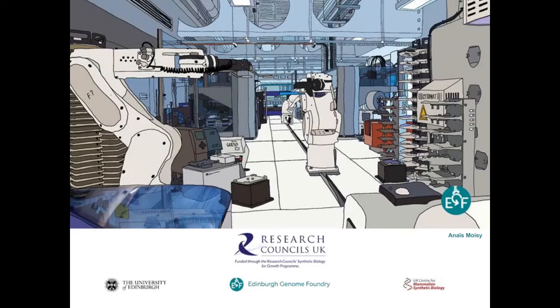What ligase and buffers do you typically work with? Oh, those are fairly bog standard. The ligase reaction for the Golden Gate that we described uses standard T4 ligase buffer. I believe we get that from NEB, and again, it's a very bog standard T4 ligase. It's not even a quick ligase; it's just the regular cheap stuff.